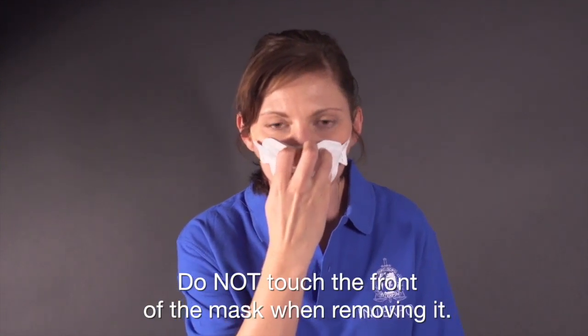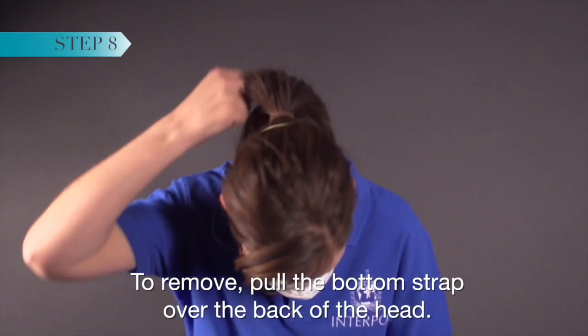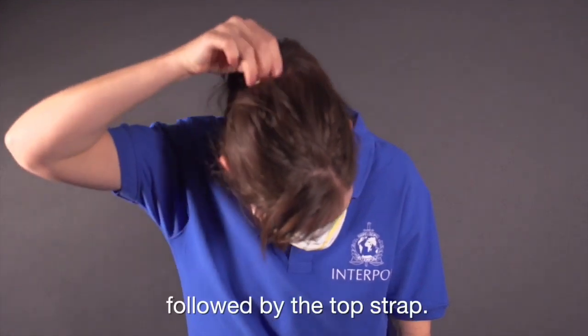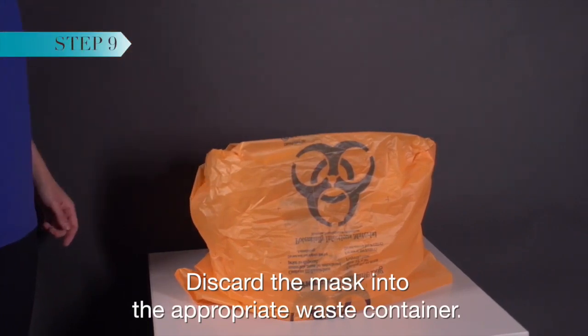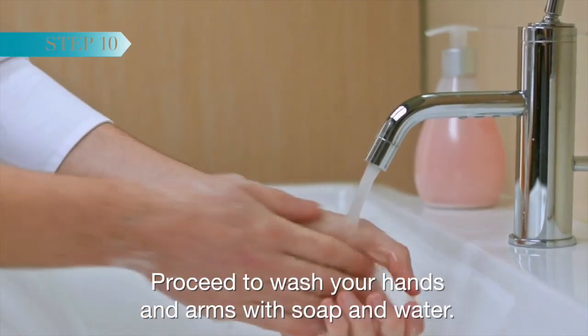Do not touch the front of the mask when removing it as it may be contaminated. To remove, pull the bottom strap over the back of the head, followed by the top strap, and discard the mask into the appropriate waste container. Proceed to wash your hands and arms with soap and water.